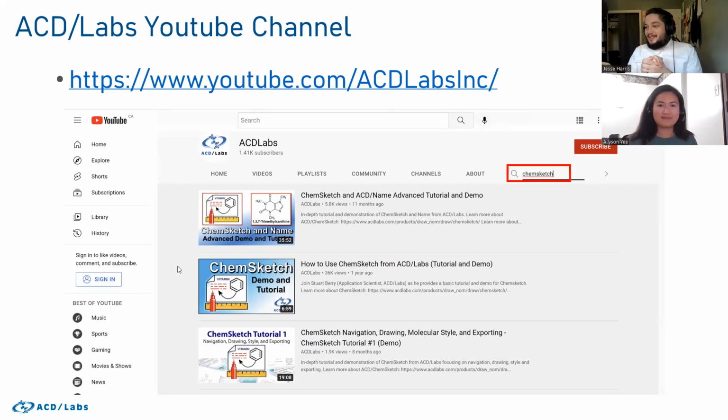Yes, I'm actually involved in handling a lot of the stuff with the YouTube channel. It's a lot of fun, and I try to create a lot of resources on ChemSketch, particularly because I know there are a lot of people who use the program and a lot of people who have questions about it. One of the particular things that I wanted to highlight, I try to do videos that are featuring these different functionalities, because there's a lot that you can do with the program. And like even now, for instance, some of the things that Allison has showed today, I was like, oh, I actually didn't know you could do that.